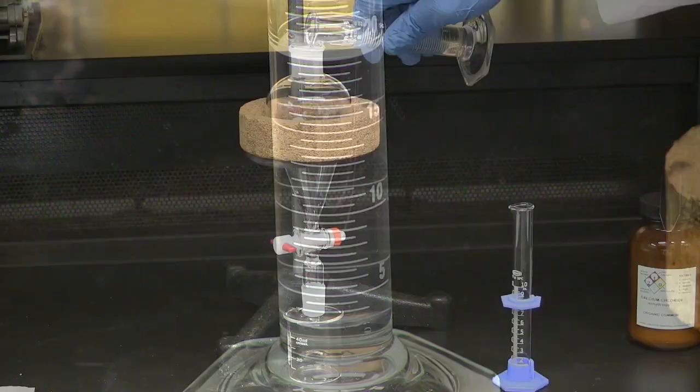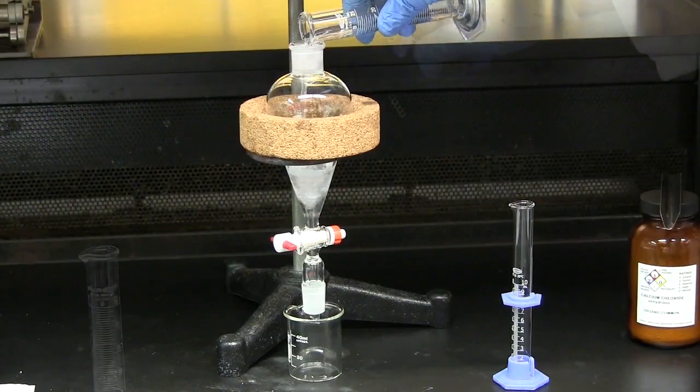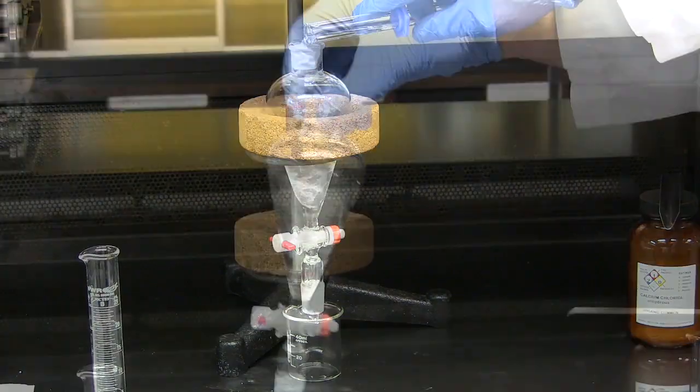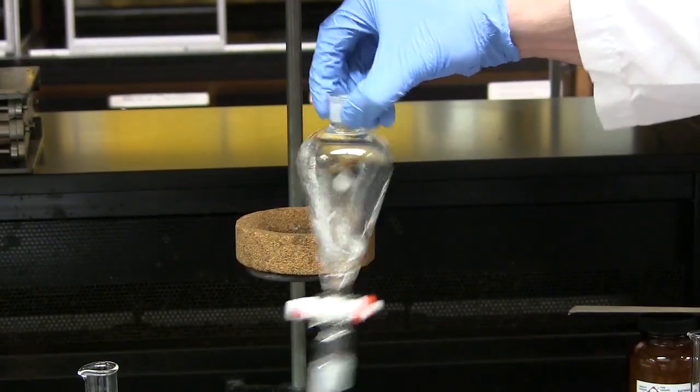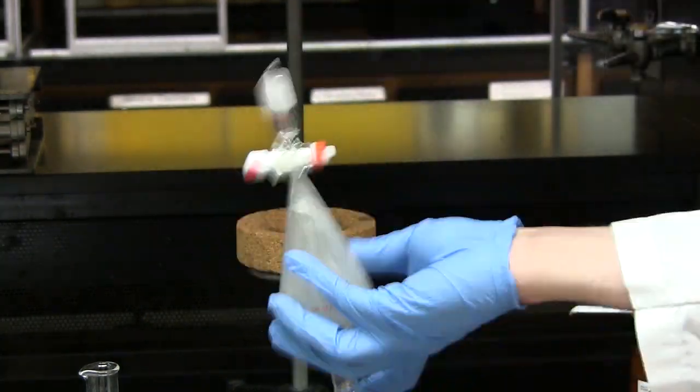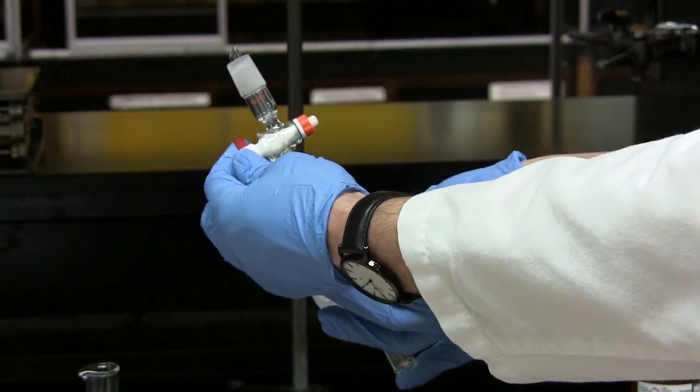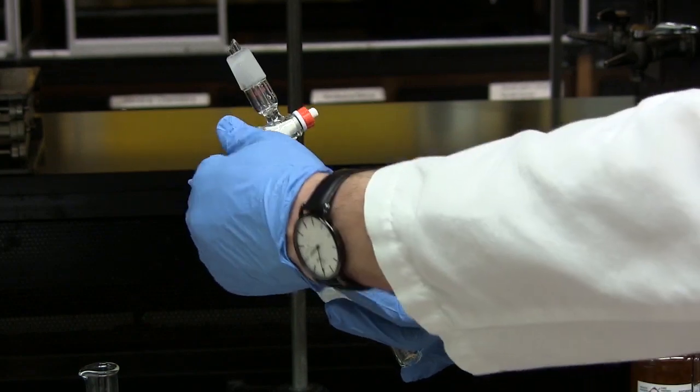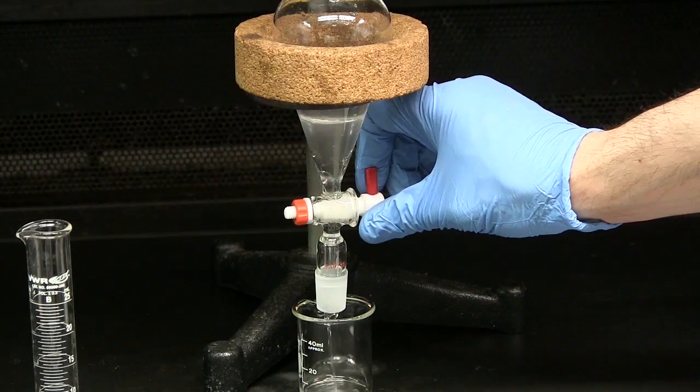Measure the volume of the organic layer then transfer to a separatory funnel. Add 10 ml of water, initially swirl the mixture with the stopper off. Next, stopper the separatory funnel and briefly shake. Remove the aqueous layer.